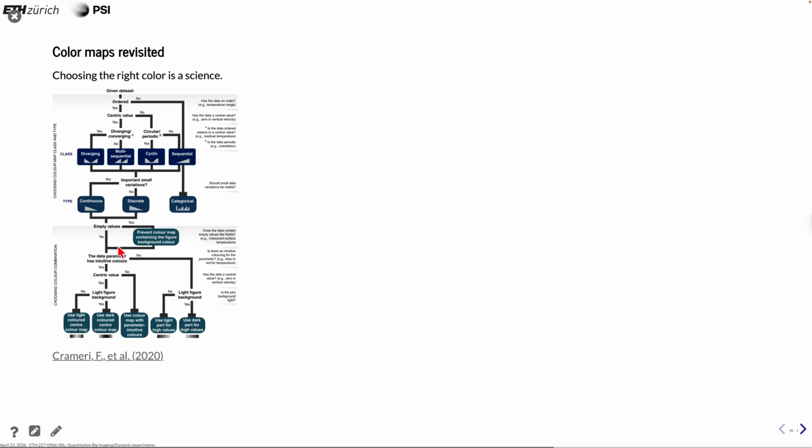then you can go into, say, which kind of color map you want to have for the background color or not. And then you can also select if you want to have a dark way, or you want to have something where the bright part is in the middle, and so on, so on. So there are a lot of guidelines in this publication that you can look at.